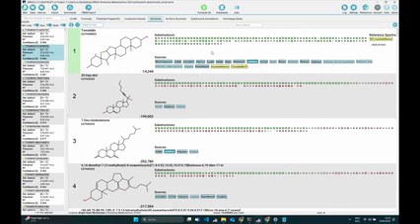Thank you. So in terms of reporting, if I am using SIRIUS and I want to report the results in a paper, which score would you recommend to report, or which values? Yeah, I would recommend to report the confidence score. Okay, thank you. So there was another question over there.